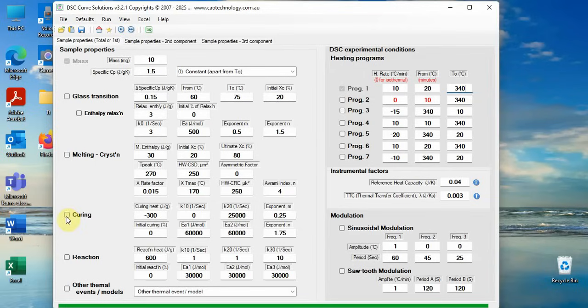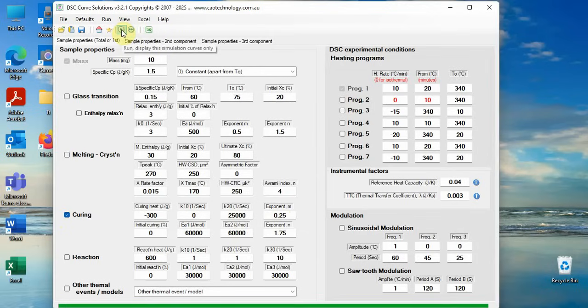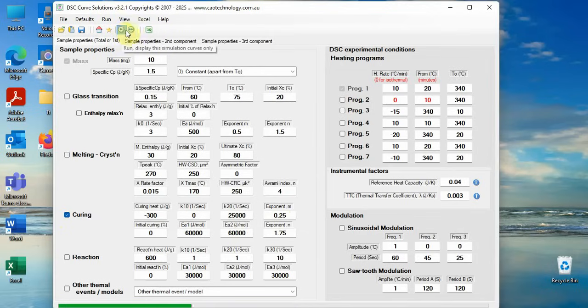If you want to simulate a curing curve of an epoxy resin, check the box curing. There are eight relevant parameters for autocatalytic models. Key in numbers into these boxes, click button run. You can see simulated DSC curves instantly.